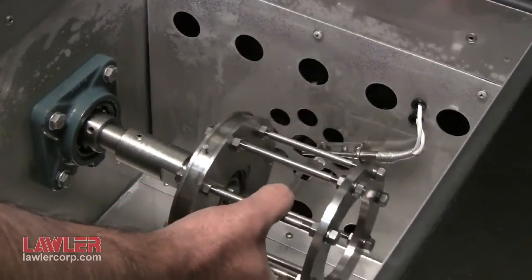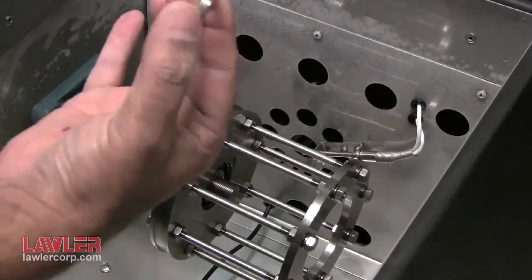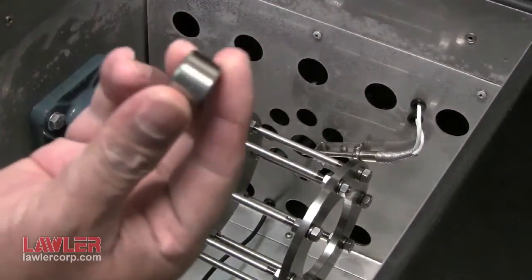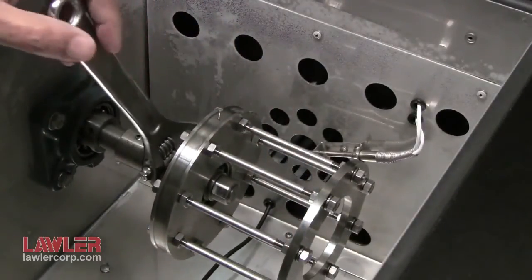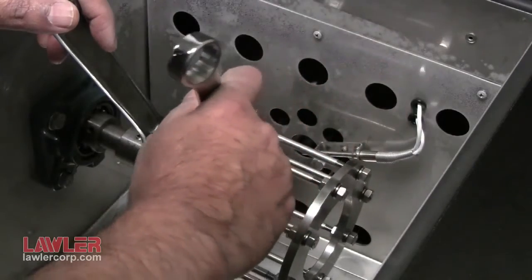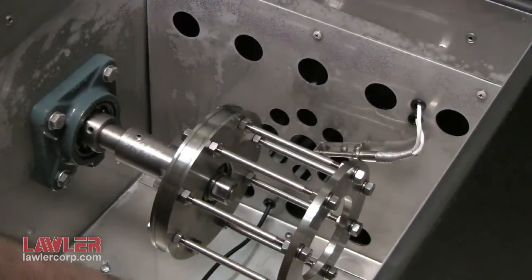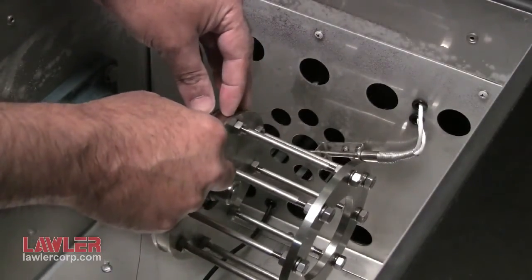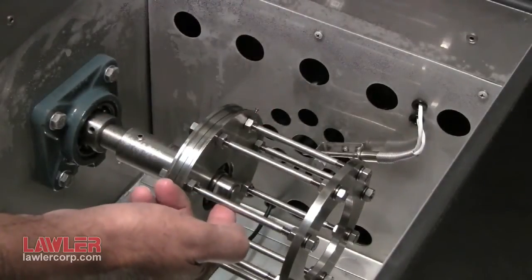Let's assemble the cage with bearing onto the shaft. The lock washer and lock nut — tighten using two wrenches. Take care not to over tighten. And the last step is to take the fishing line with the loop and place it over the pin. And that completes the setup for D1478.